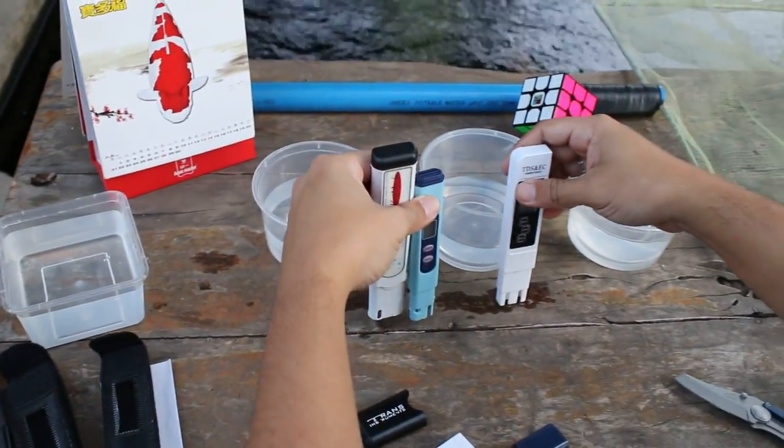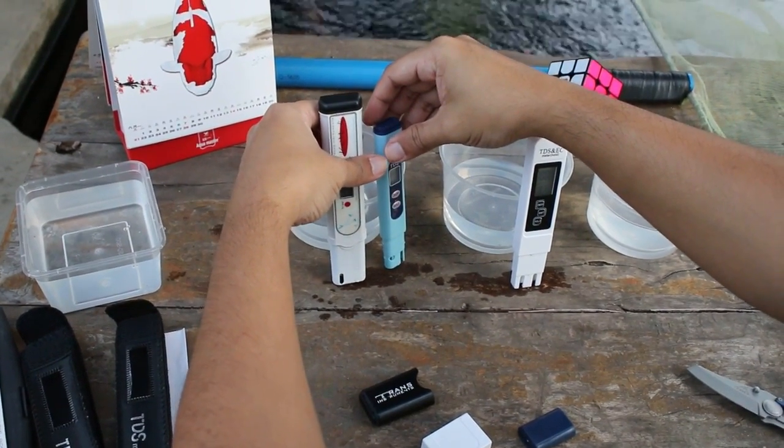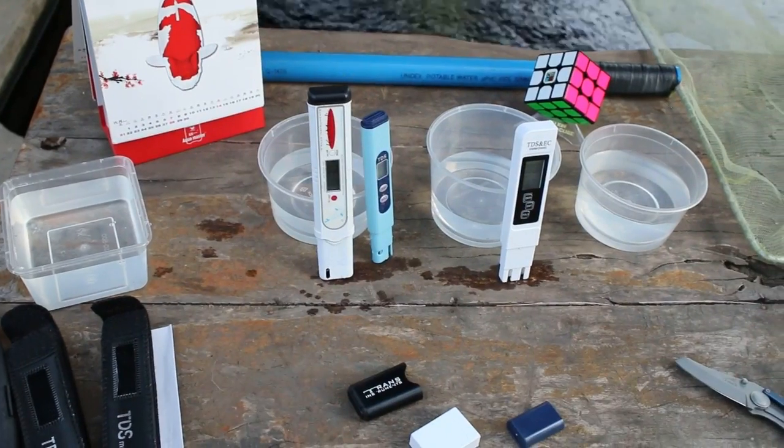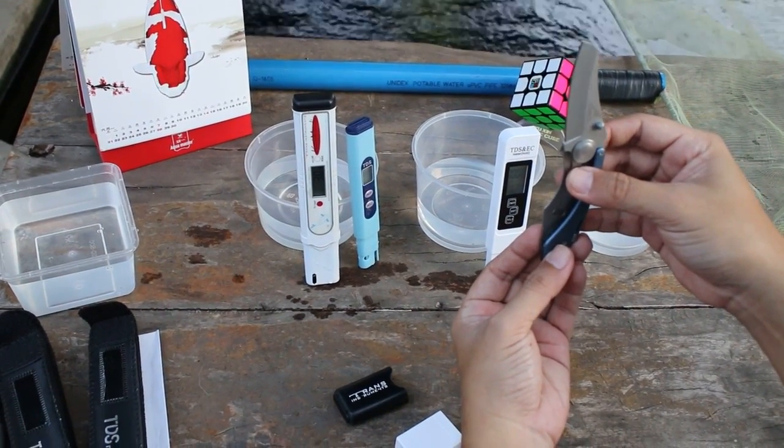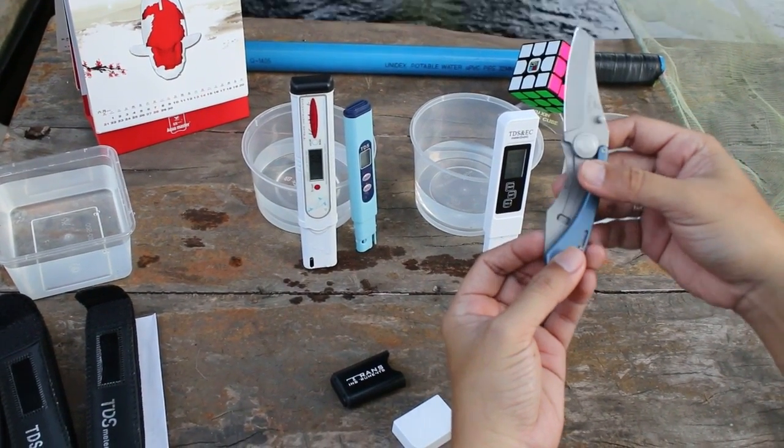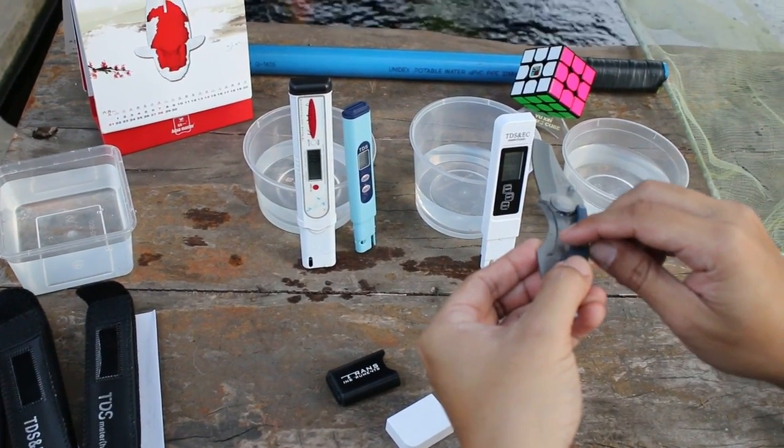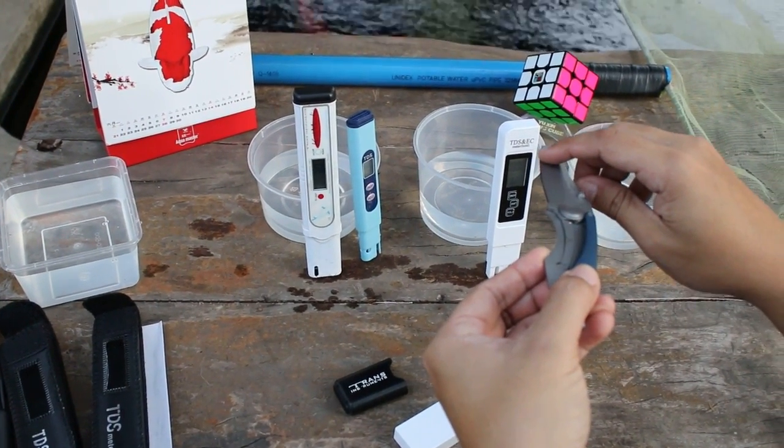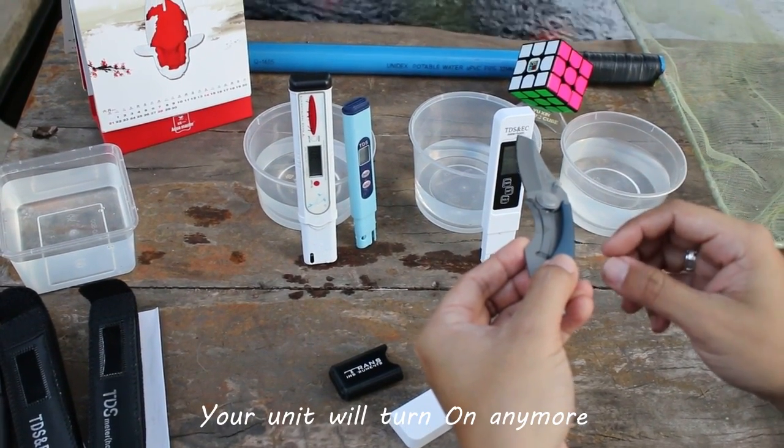You notice me keeping these devices in an upright or standing position. The reason behind that is, let's say this is a device, then there's water here. Sometimes if you put it on a horizontal position, the water that's in here in the probe, it's going to crawl inside the unit and into the batteries and it's going to corrode the circuit and your unit will not turn on.